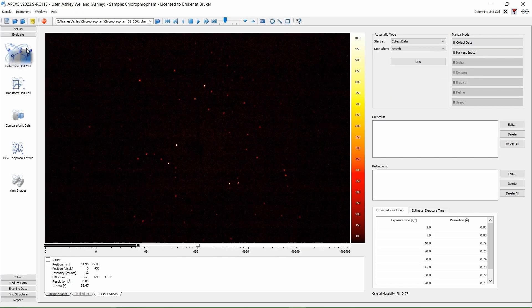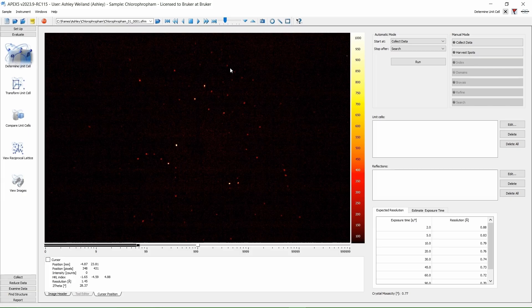After the 3 minute fast scan is completed, you will be taken back to the screen with your newly collected images in the image viewer. Click on Harvest Spots.